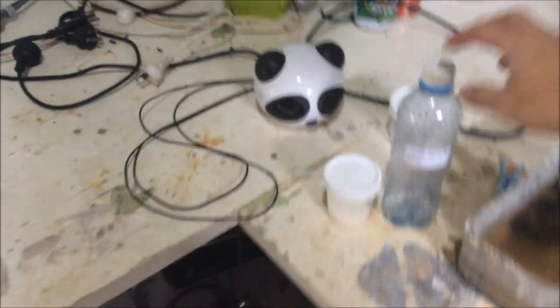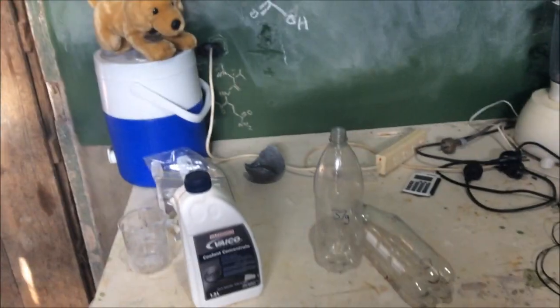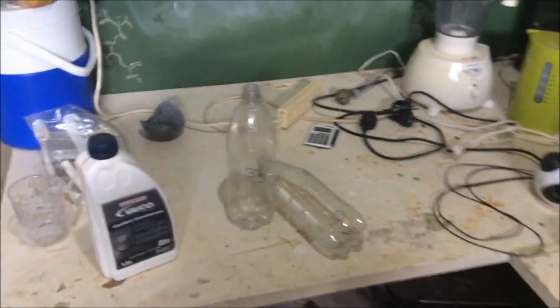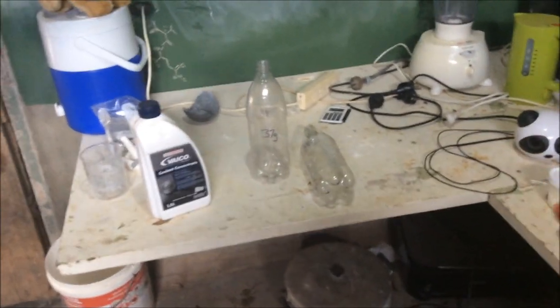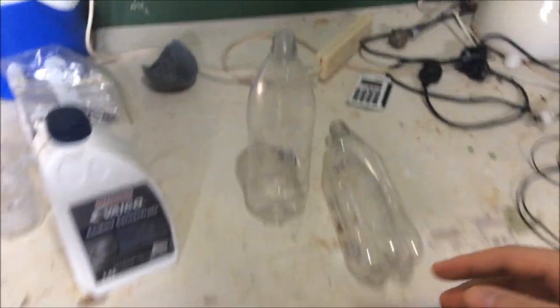And we know that because we use it every day. Like I can store a large variety of chemicals in it. Like here we have distilled hydrochloric acid, it's not affected. Obviously things like sodium hydroxide will get to it eventually but from what I read it's a very slow reaction at room temperature. In fact aqueous solutions of sodium hydroxide can take weeks to break it down to a reasonable extent.